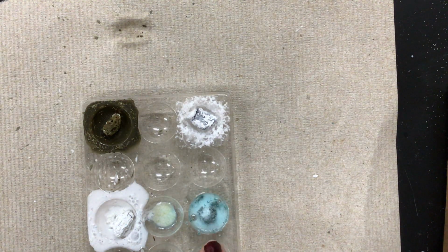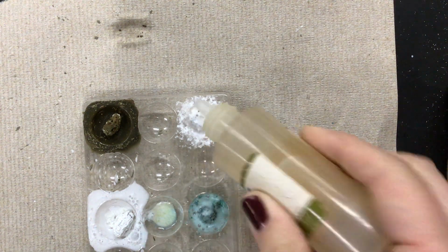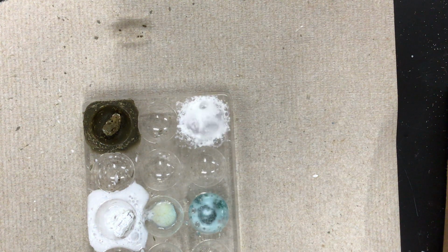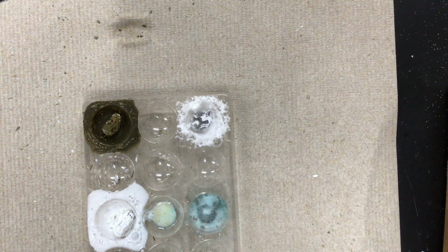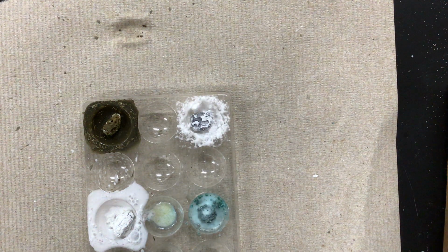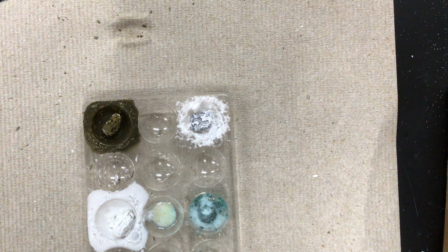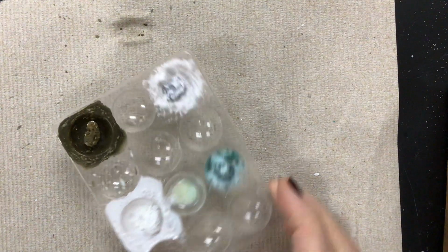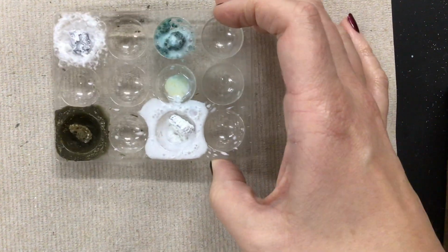Okay, and the copper is still going, friends. All right, let's add a little bit more hydrochloric acid just for fun. Oh yeah, that's a very violent reaction. And the copper is still going. All right, I'm going to set that aside, still in your field of view.